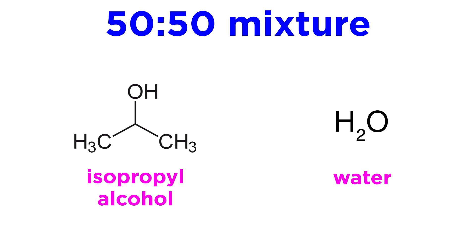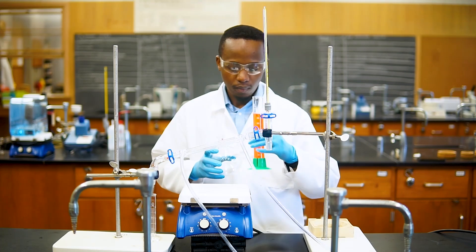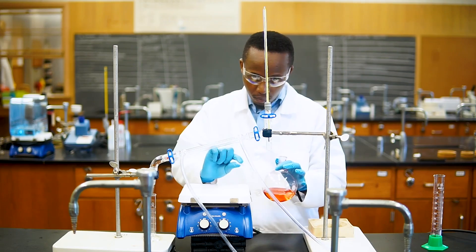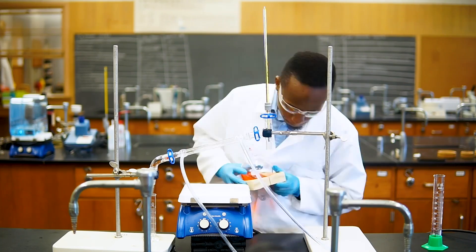Today we will be distilling a 50-50 mixture of isopropyl alcohol and water with some dye added to it, which will give our solution some nice color. The boiling point of isopropyl alcohol is 82.5 degrees Celsius, while water is 100, so the alcohol is the substance that will vaporize here. Because the dye is much more soluble in water than in the alcohol, our distillate will be clear, leaving all of the dye behind in the water, acting as a visual confirmation that separation is occurring. When adding your solution to the round bottom flask, the liquid level should be around halfway up the flask or lower, as we do not want any liquid to splatter up into the condenser. Next, let's add a stirring bar so that we get even heating in our mixture. We can also add a boiling chip to make the mixture boil more calmly.